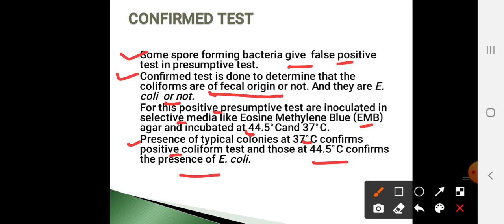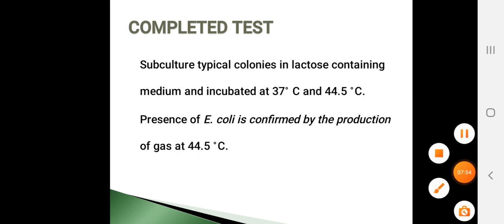This procedure has been followed for the confirmed test. The next one is the completed test.